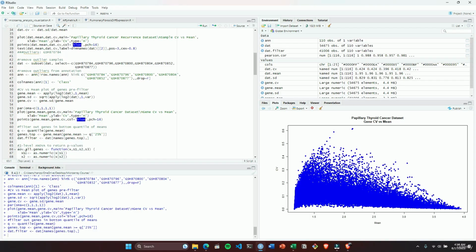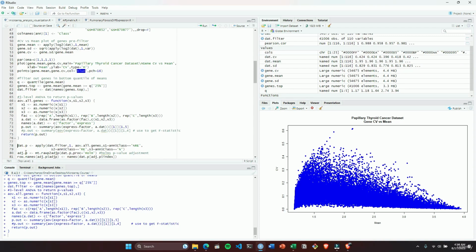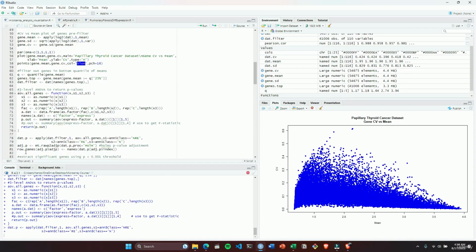Here you can see this. So that is for applying the data and getting your values again. I'm just showing you how to do this again. The adjusted p-value is going to take some time because I want you to know that RStudio can get stuck sometimes. If my RStudio got stuck, yours can be as well. So what you need to do is run the script again if you want to make significant changes according to your own needs. And now we are getting the plots.